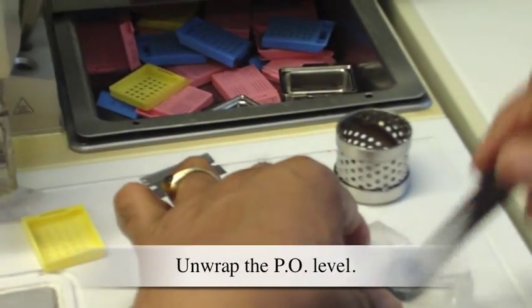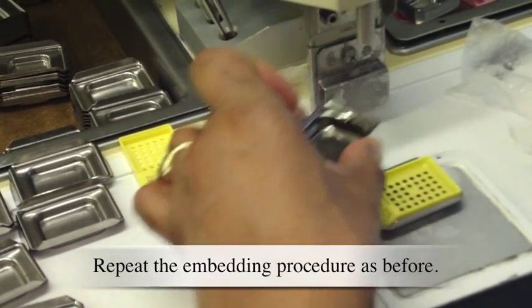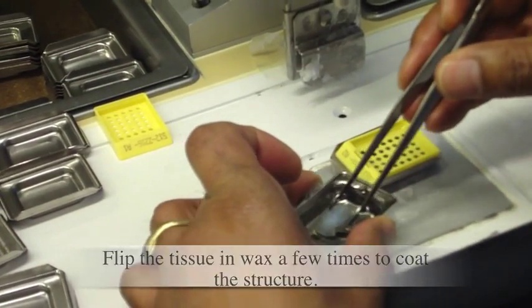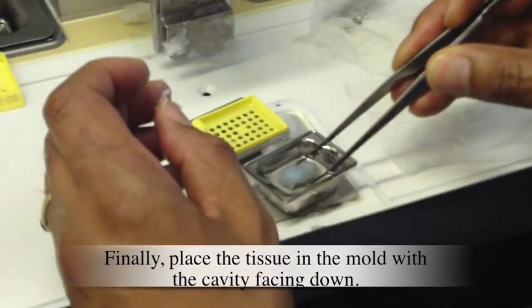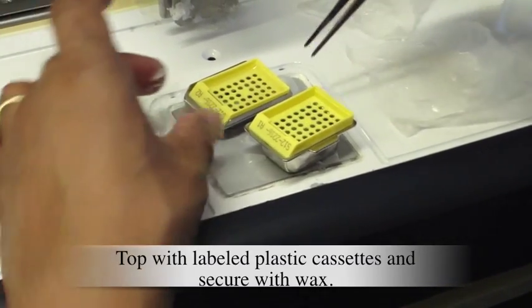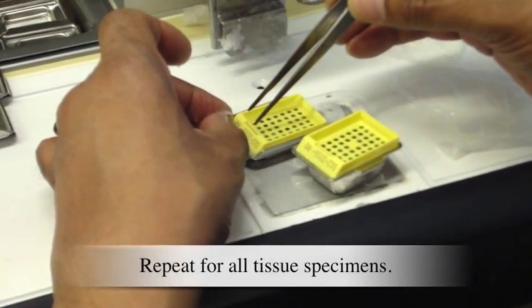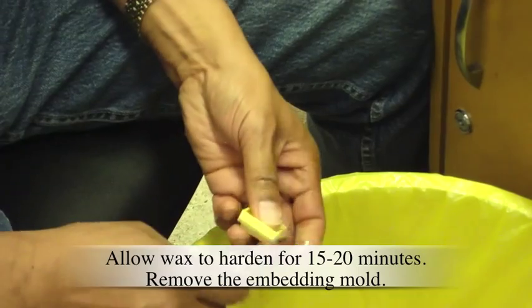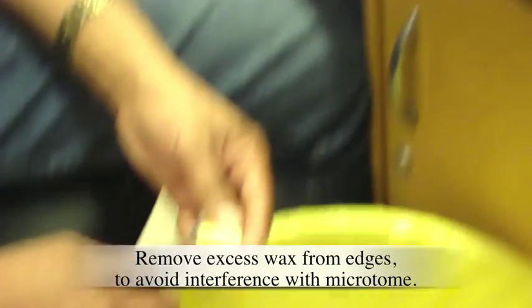Unwrap the PO level and repeat the embedding procedure as before. Flip the tissue in wax a few times to coat the structure. Finally, place the tissue in the mold with the cavity facing down. Top with labeled plastic cassettes and secure with wax. Repeat for all tissue specimens. Allow wax to harden for 15 to 20 minutes, then remove the embedding mold and remove excess wax from edges to avoid interference with the microtome.